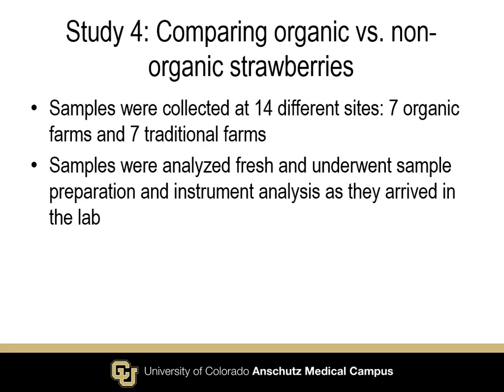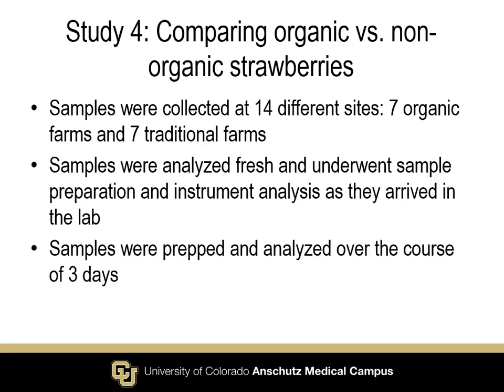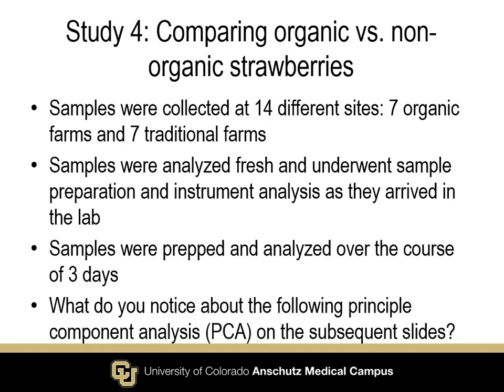They were analyzed fresh, and the prep was done, and the instrument analysis, as soon as they arrived in the lab. Unfortunately, they didn't all arrive in the lab at the same time, so they were prepped and analyzed over the course of 3 days. So what do you notice about this? Actually, I'm going to go ahead and show this now. So they were prepped and analyzed over 3 days.